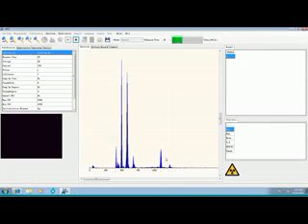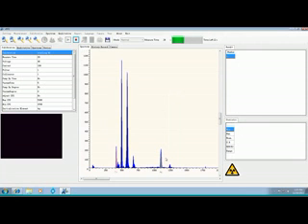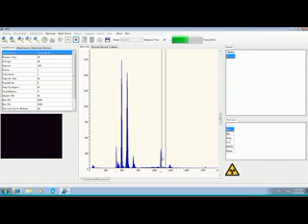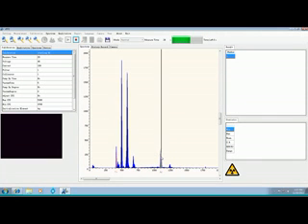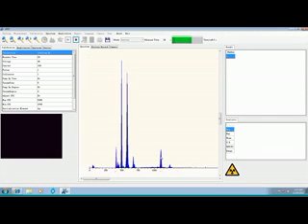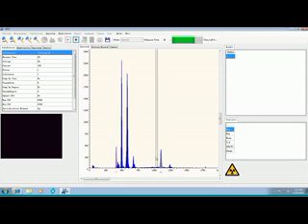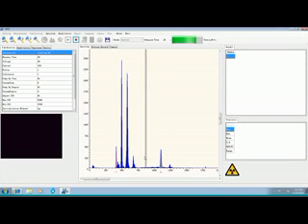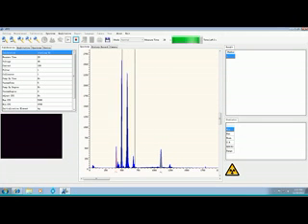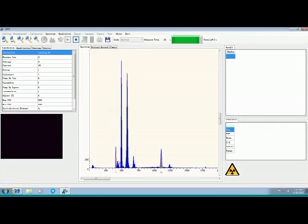Okay, just a little longer. Now what's nice if you scroll across here with your cursor and you go on top of each one, you'll see that the first one is silver. So you know it's yellow gold to begin with because it has silver in it. We can actually display what all of these elements are and we'll get into that in another section.